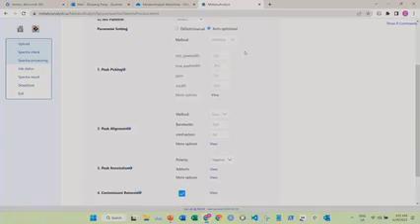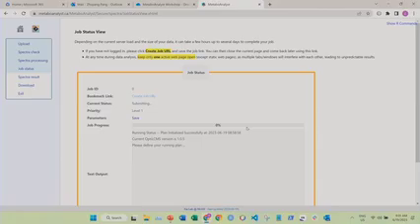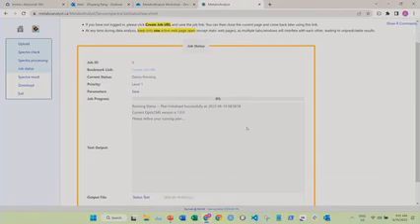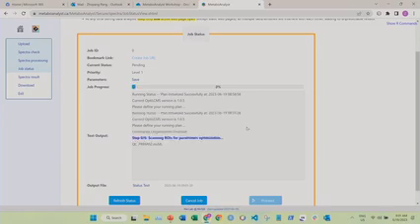So here I want to show you the auto-optimized workflow. I can just quickly submit. So the data have been submitted. It's being processed. It will take around 2 minutes to finish. So let's wait a little bit.